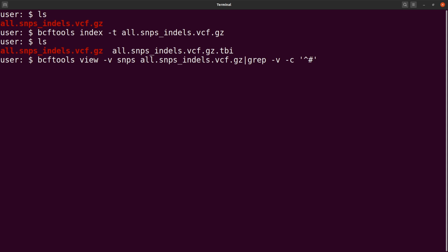Let me say that I have covered a separate tutorial on how to do the variant count. For that tutorial, I give a full explanation of whatever I am doing here, so please watch that. Now let's proceed. Once I have this, I run it, and I will get the counts. We have this number here, 884,455. These are the number of variants for the SNPs.